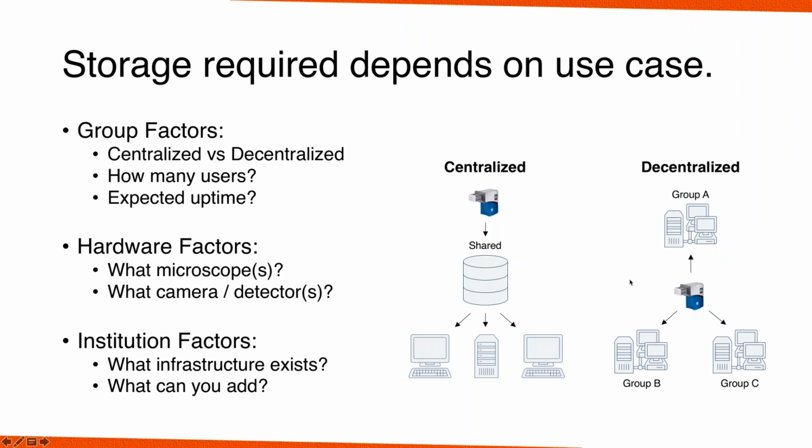Or you've got the decentralized option here, where maybe your facility has a K2 and it's outputting data, and everyone just has their own storage. No one wants to share that kind of thing. So both of these are viable options.